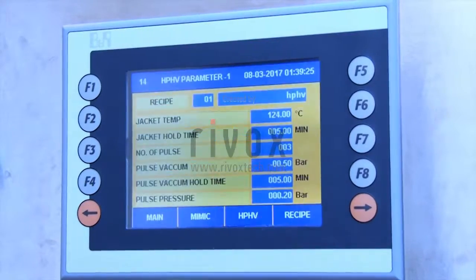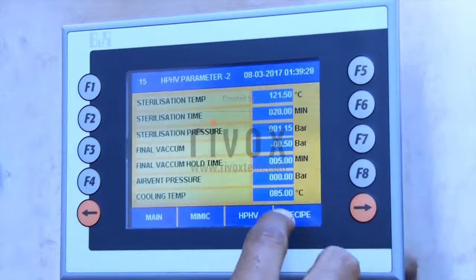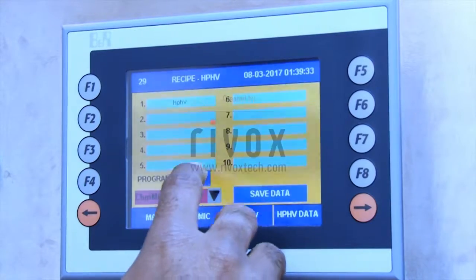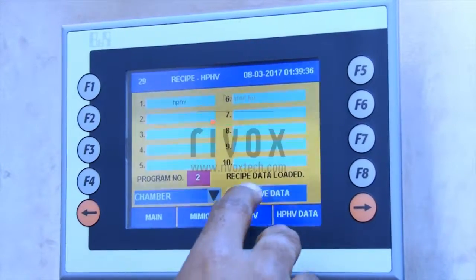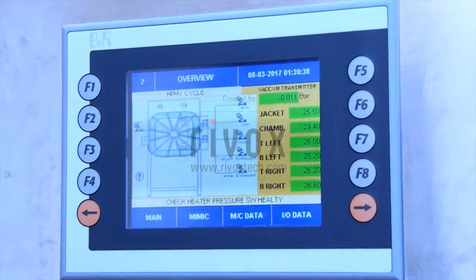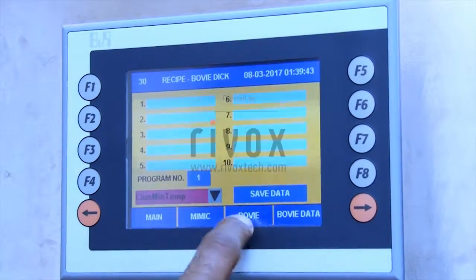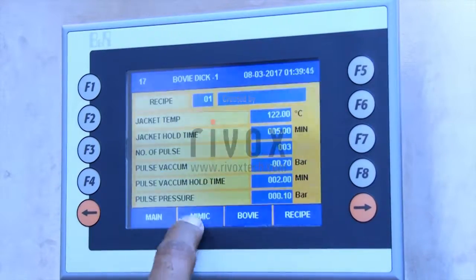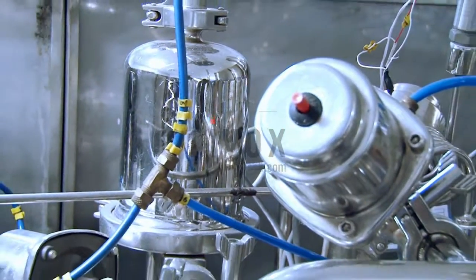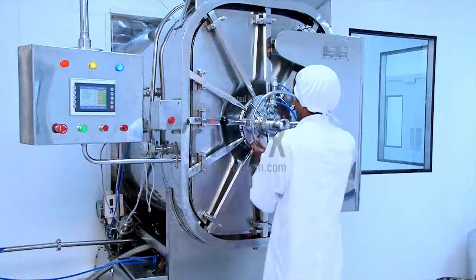Neelam Industry steam sterilizer has inbuilt programs like HP cycle, fast exhaust cycle, slow exhaust cycle, chamber leak test cycle, Bowie-Dick test cycle, AOP cycle, and in-situ filter sterilization cycle.